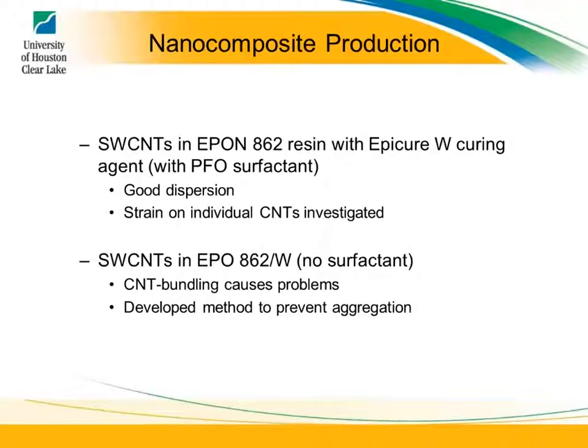a particular curing agent. Does everybody understand about epoxy? Everybody use epoxy before? You buy the fast curing epoxy, usually there's two tubes. You push the two tubes out. One tube is the resin, the other tube is the curing agent. When you mix those together, you end up with cross-linking between the curing agent and the resin, and it forms a very hard object after it cures.